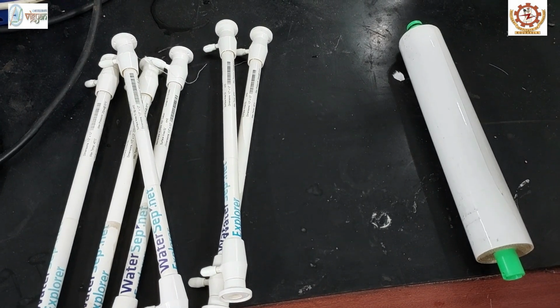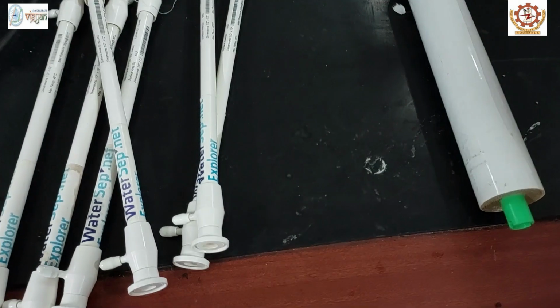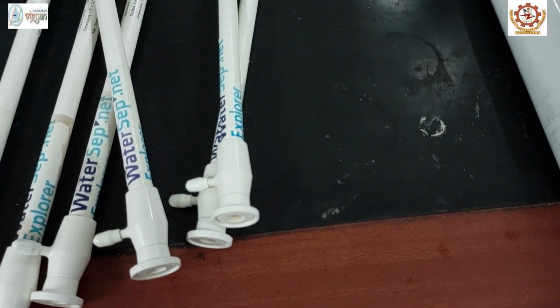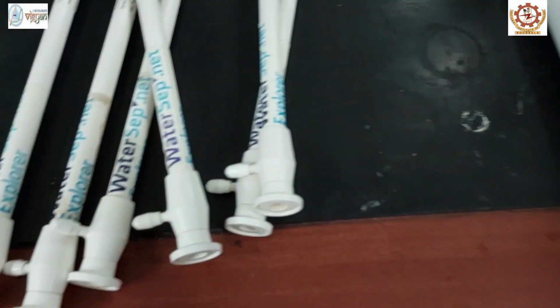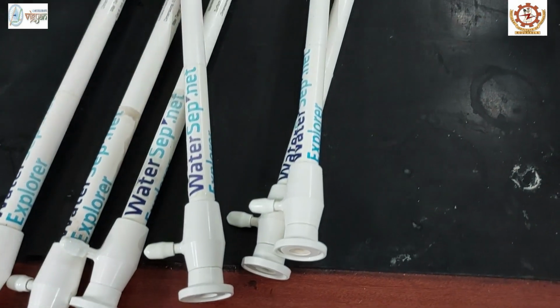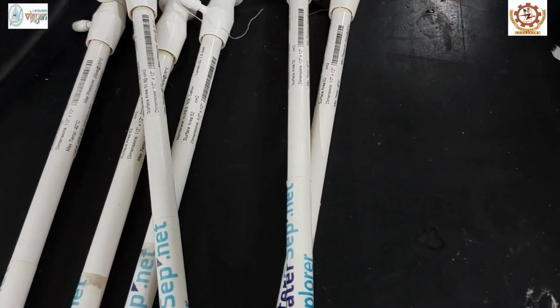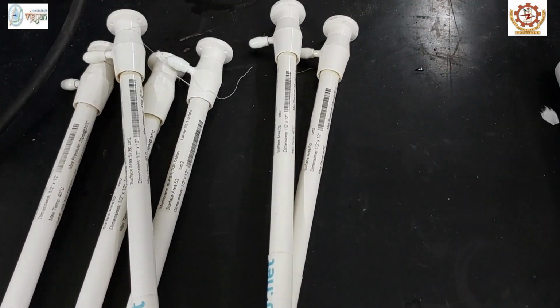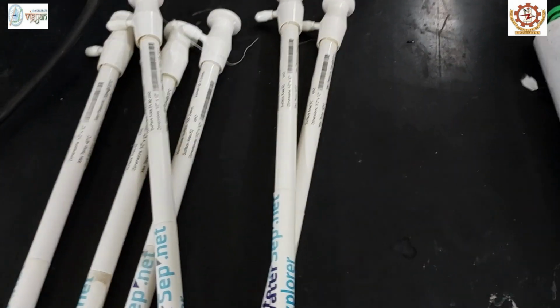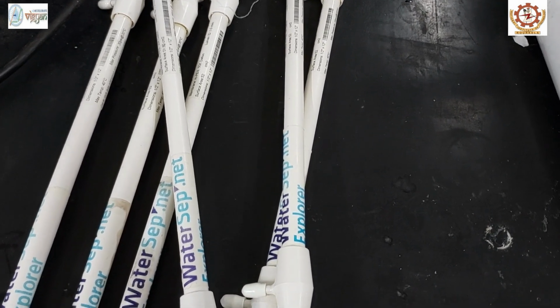The hollow fiber modules consume only the minimum energy and have a thick packing density. However, they show a fouling tendency, hence making it difficult to treat highly viscous feeds or feeds with higher solid content. Also, these modules are very hard to maintain and clean.